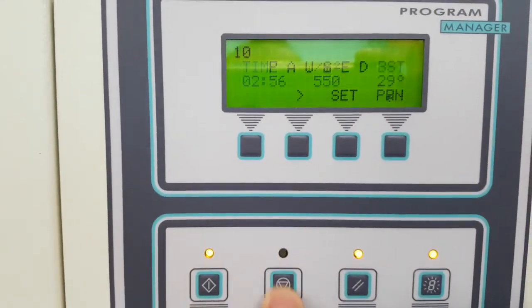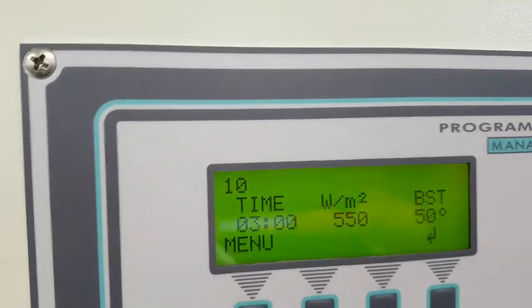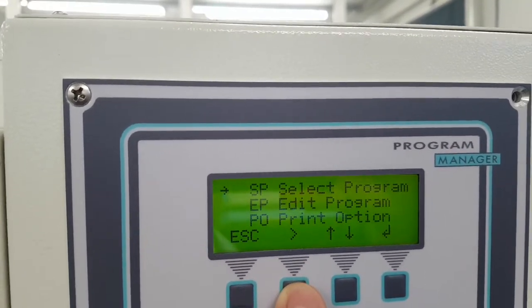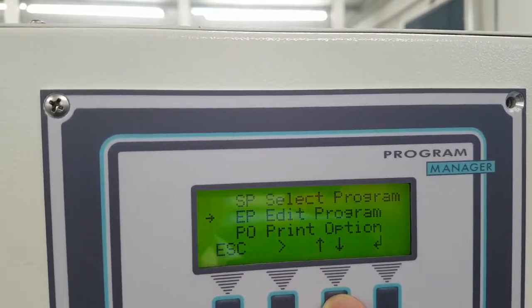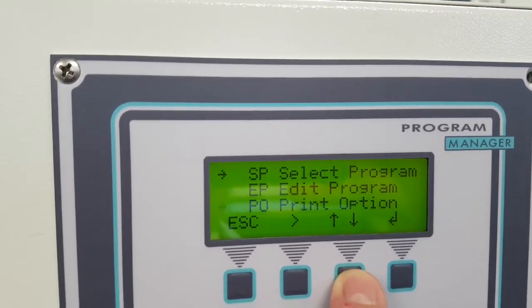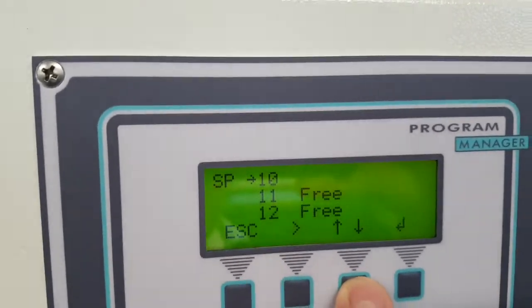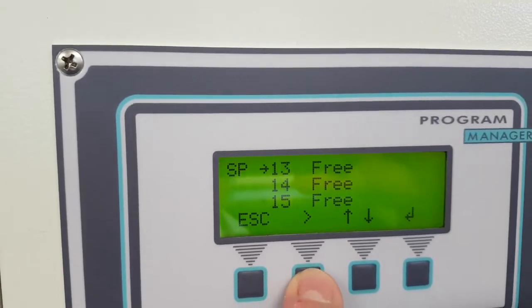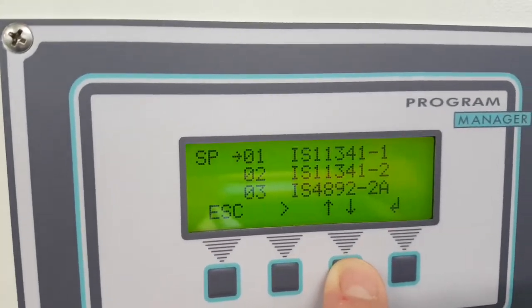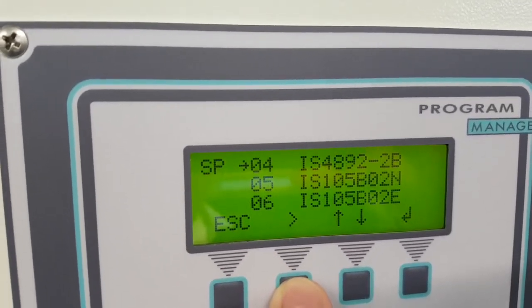You can stop it and reset. Then you have the select — you can enter the program and the calendar. You edit the new product and you can print the test results that you have done. You select the program; you can switch between 15 programs to select.